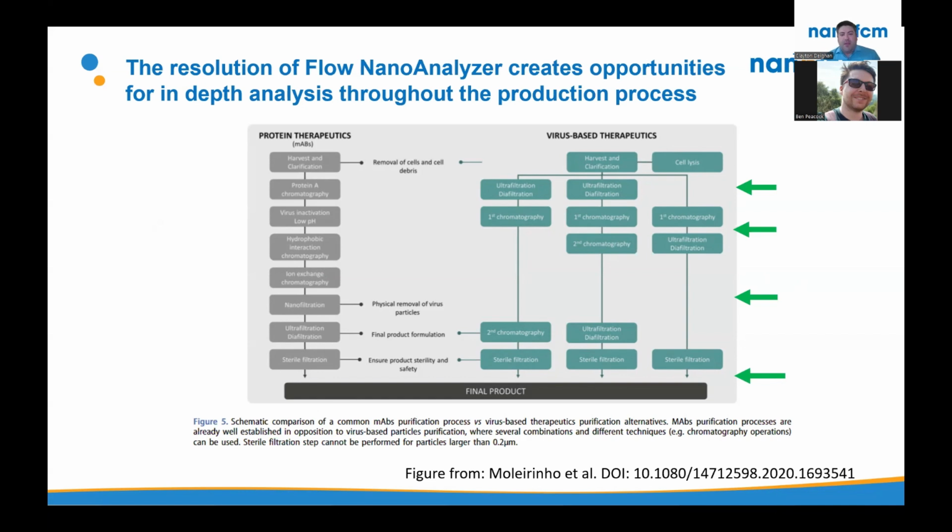You can get at the labeling of the distinct viruses. You can size them distinctly. You can see the way that the RNA intercalating dyes intercalate the different sets of particles. And you don't need them to be highly polished from potential contaminants like we saw in the fragment slide with the incomplete virion type particles, and also the main contaminating component, the extracellular vesicles, which the cells bud off.